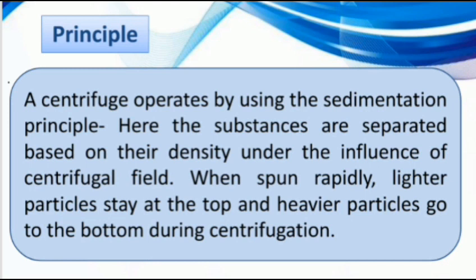These suspended materials can be particles such as clay or powder. Sedimentation principle: here the substances are separated based on their density under the influence of a centrifugal field. When spun rapidly at very high speed, lighter particles stay at the top and heavier or denser particles go to the bottom during the process of centrifugation.